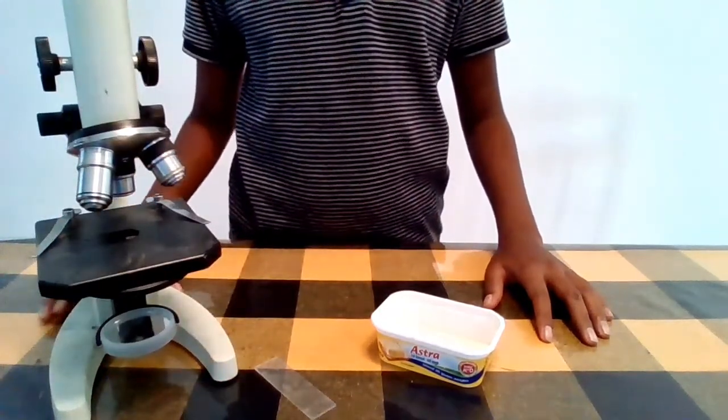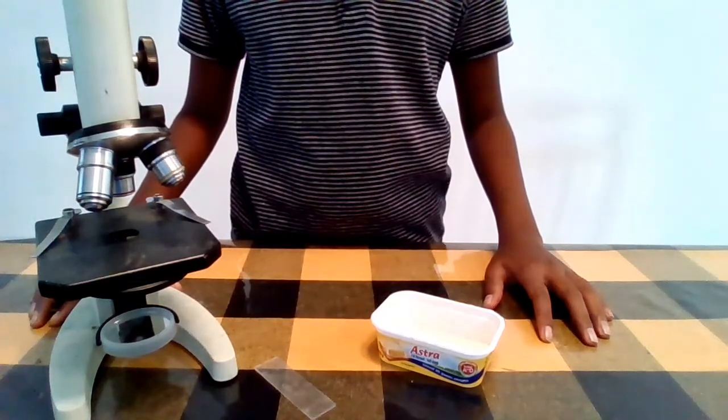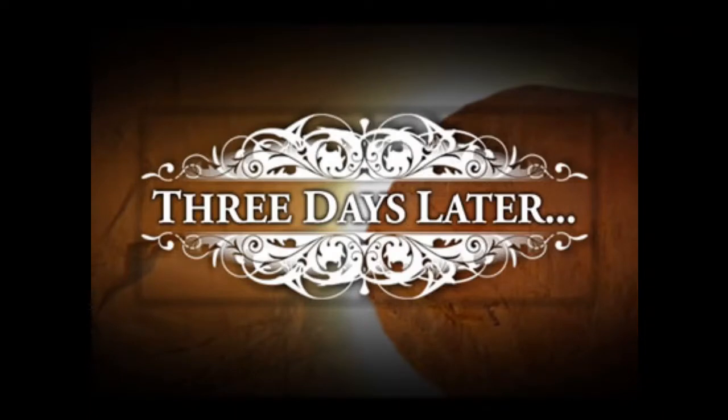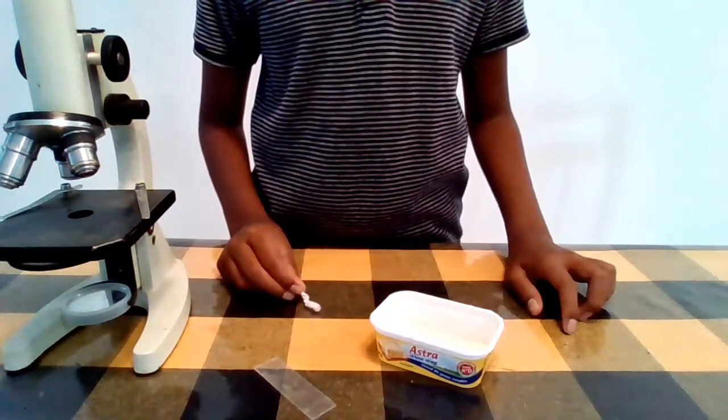Okay, now let's see what is the method. Put the coconut water into a clean container and keep it for 3 days. Then put a drop of coconut water onto the glass slide and observe through the microscope.